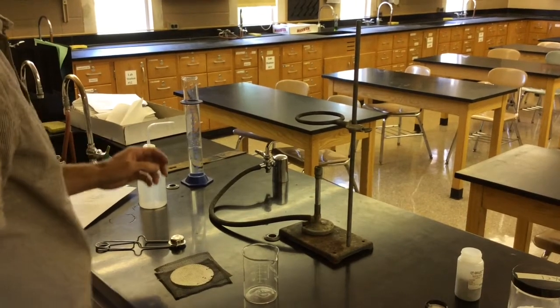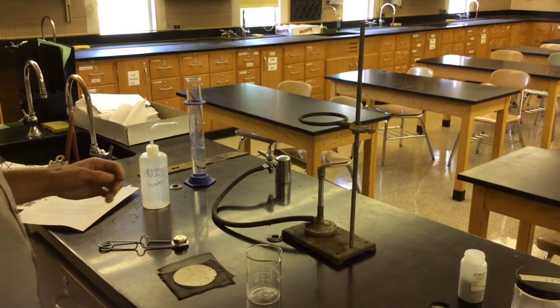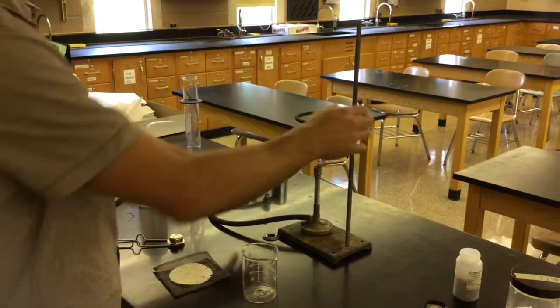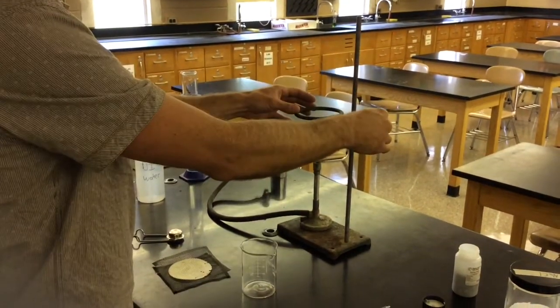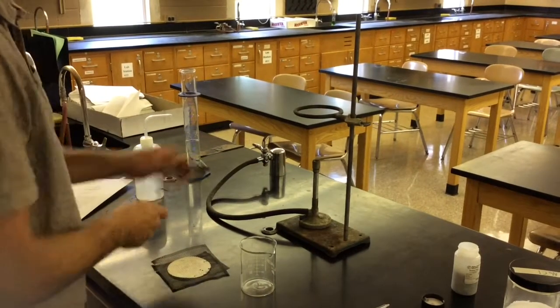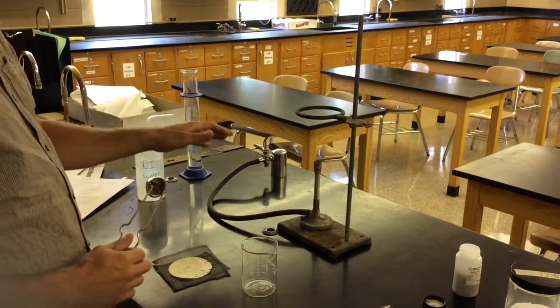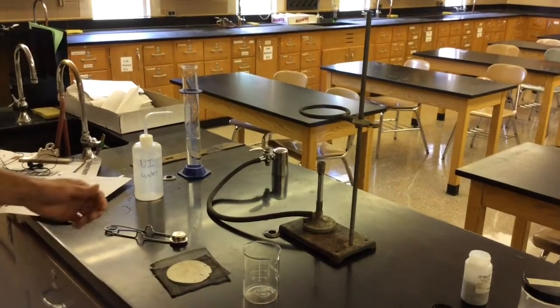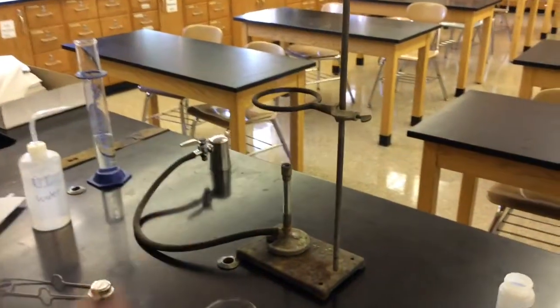Alright, we are going to go over how to do the setup for the producing and displaying experimental data lab. First thing I would do is get the ring stand with the iron ring and the Bunsen burner under it. And what you want to do is, before you have any glassware on there, check the height of the Bunsen burner flame to make sure it's a good height, because you might have to move this ring up or down.